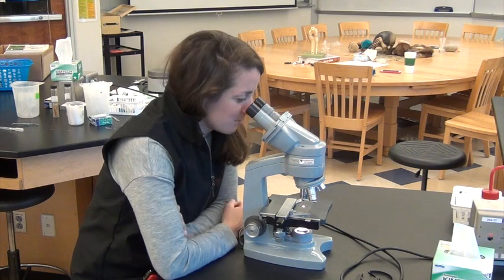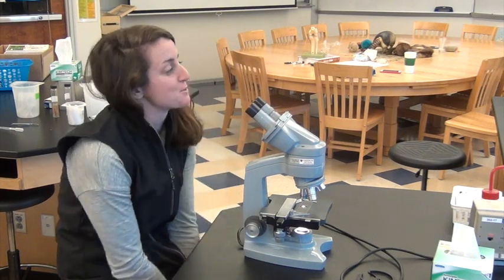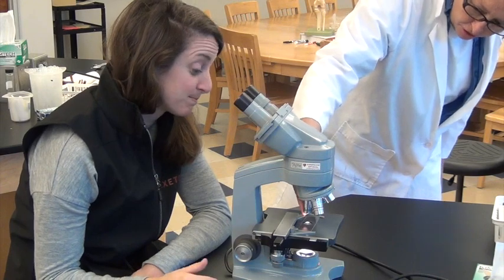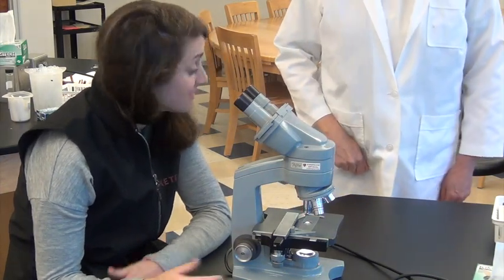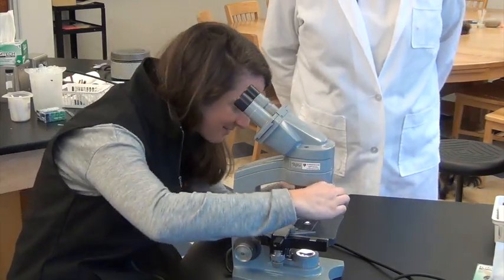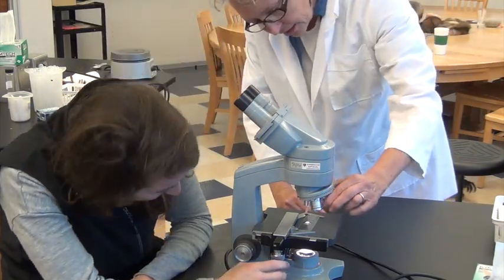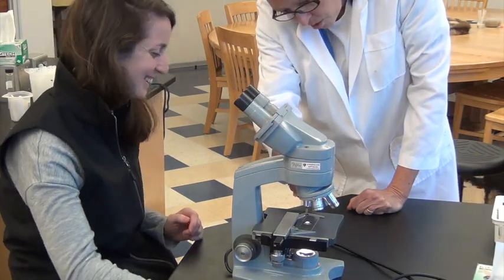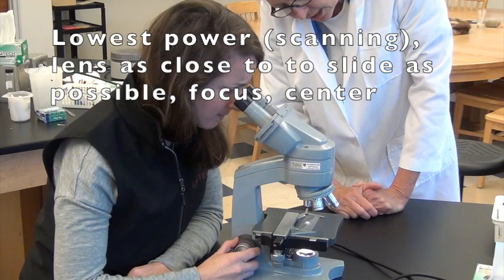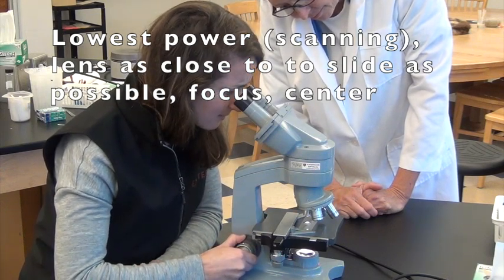I can't get this in focus. I've tried everything. Miss Stevens! Oh, Katie, look — your objective lens is like two inches above your slide. Something is wrong, so go back to the very beginning, to the lowest power. Go all the way back to the lowest power and use your coarse focus to get the slide as close to the objective lens as possible. There you go.